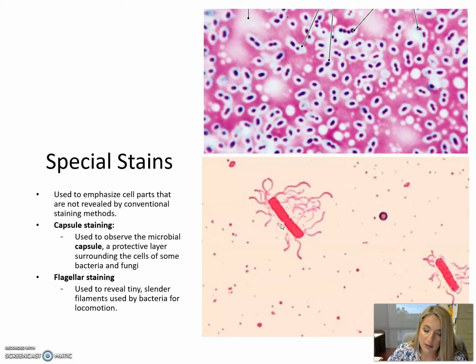But if your intention is to actually see where and how many flagella are present, well then you need to do a smear preparation followed by a flagella stain.